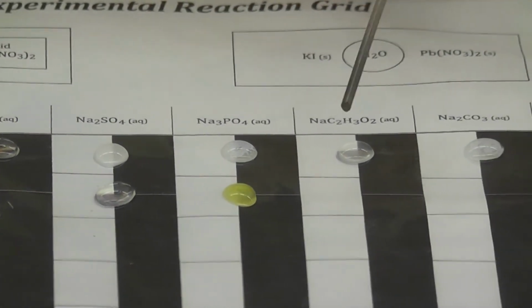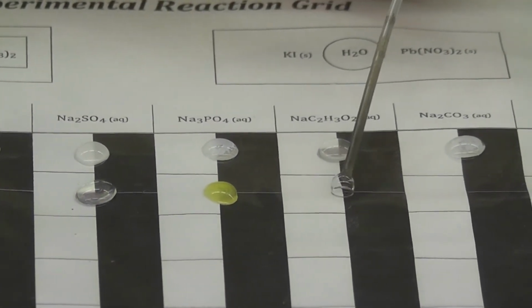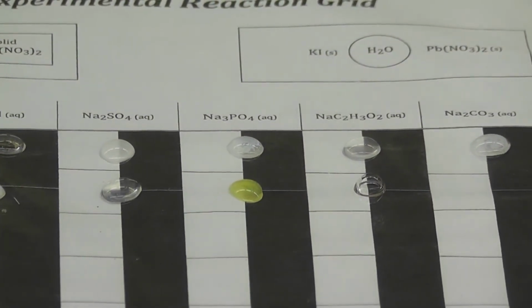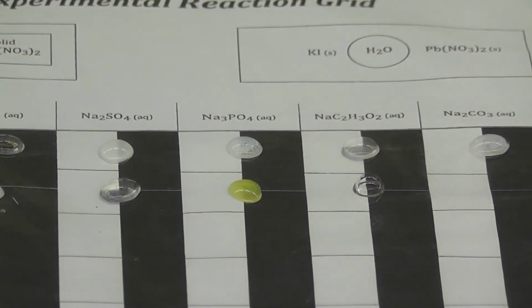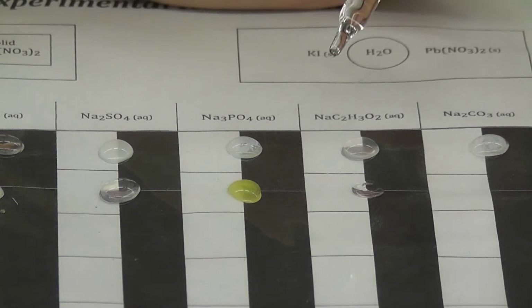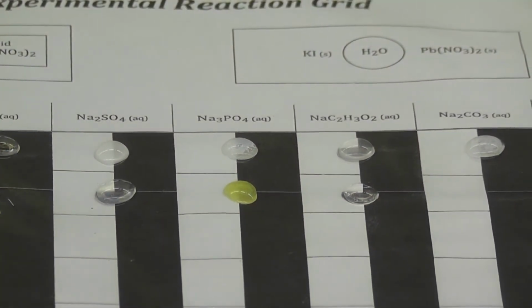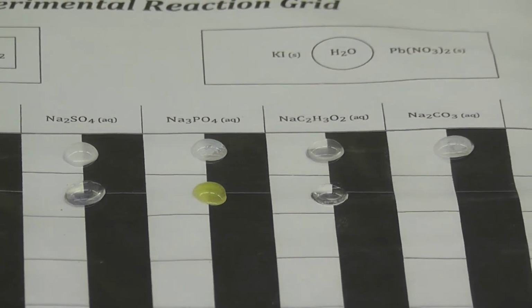So we add 1 drop of the silver nitrate. Okay. And the sodium acetate we're going to mix with it. So 1 drop of silver nitrate mixed with this 1 drop of sodium acetate. And that's what our reaction gives us.